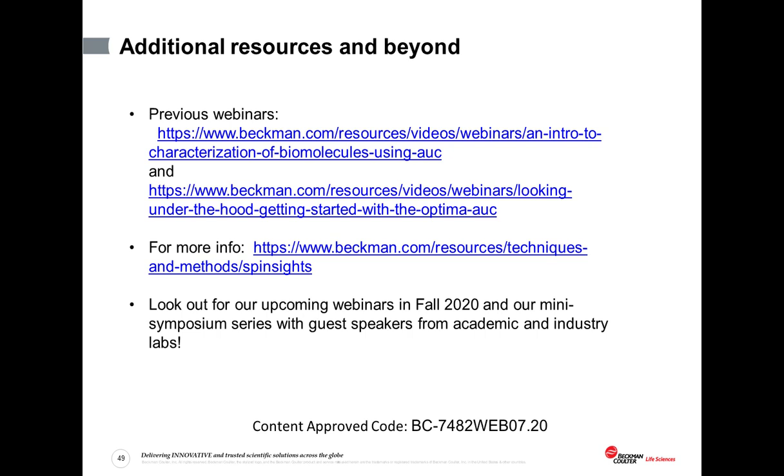Of course, I strongly suggest that you do a bunch of UV-vis measurements on a cuvette to make sure that you're able to correlate the 280 and the 230 nanometer measurements, in order to establish linearity in your dilution series. Correspondingly, if you have to go to higher concentrations, then just start measuring off the 280 nanometer peak. Measure at 290, for example, where the extinction coefficient is going to be lower.